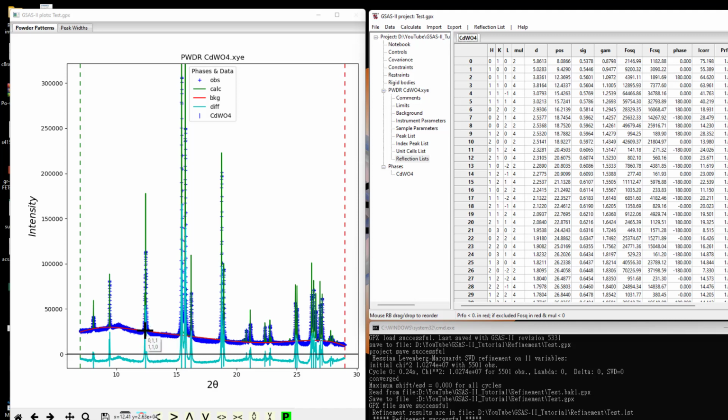Now we need to improve it. Maybe there is some difference in the full width at half maximum. There is maybe a slight shift in the experimental and the theoretical data, and that's what we call the refinement. Try to match them exactly with the experimental data. My mistake.